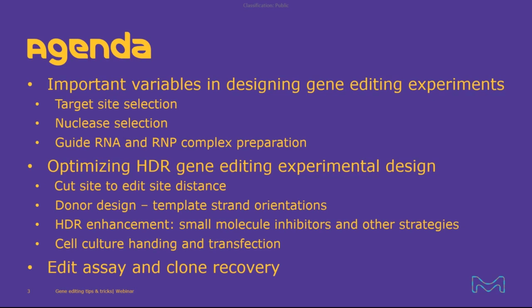I will explain why the distance from cut site to edit site is critical to HDR editing efficiency, and give you some tips on how to optimize donor design, how to enhance HDR editing with small molecule NHEJ inhibitors or other strategies, and how to handle cell culture and transfection.